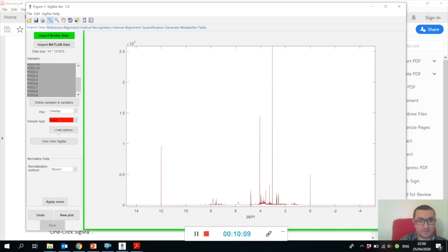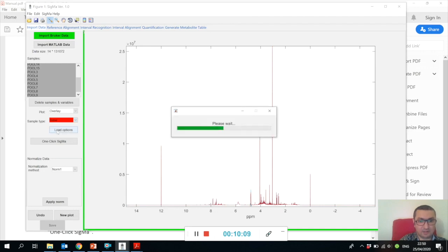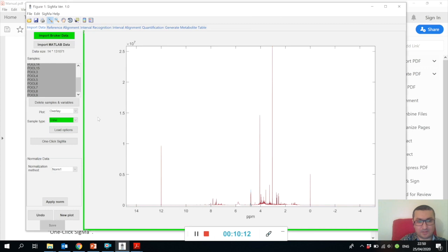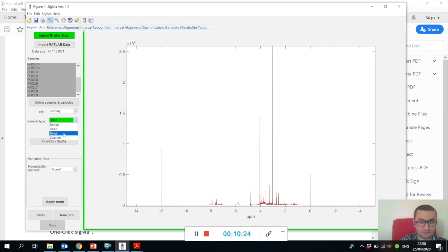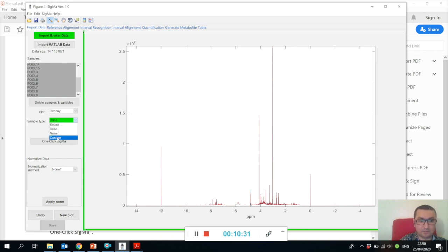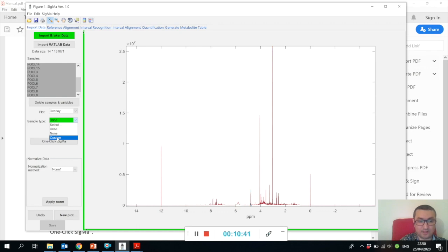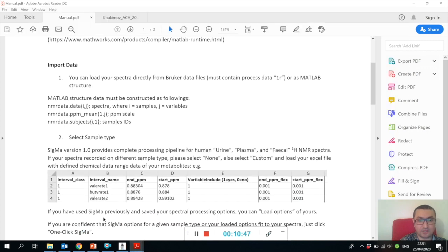Before you do anything, you should specify in the sample type that it is a urine sample, and I will explain why. We have a reference urine spectra which we need in order to map the signature signals. If it's not your spectra, you are welcome to say 'none' and then you will have to define the signature signals yourself later, or you can even do custom. This will ask you to open an Excel file where you specify the regions of each signature signal in your spectra. How this Excel file should be organized is also in the manual.